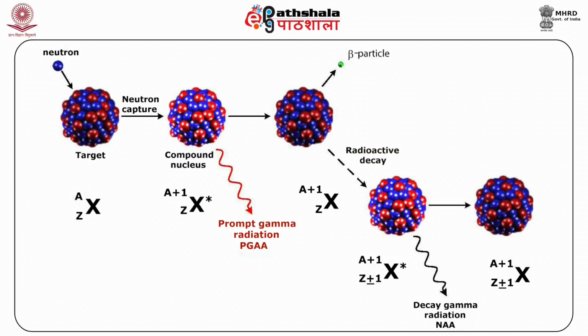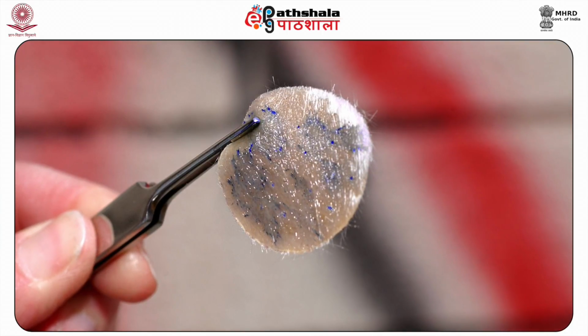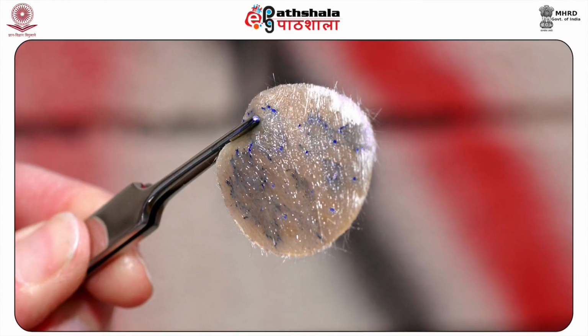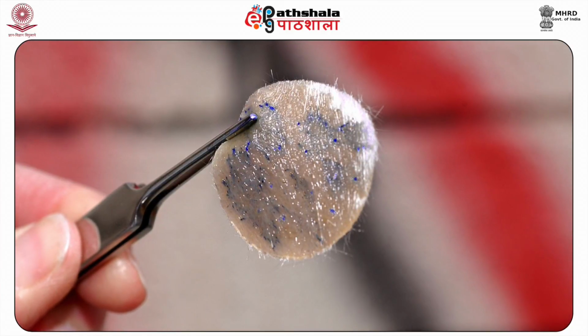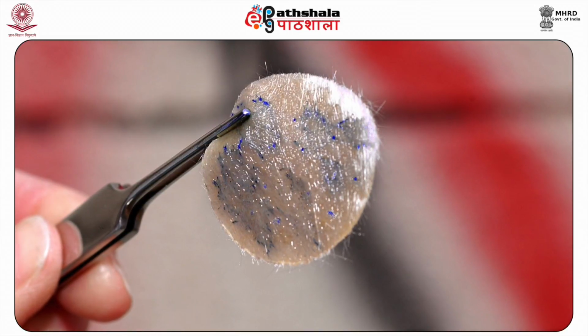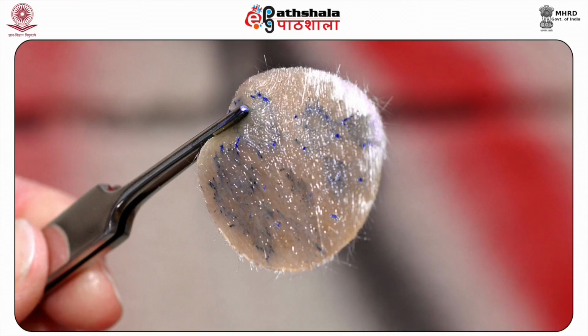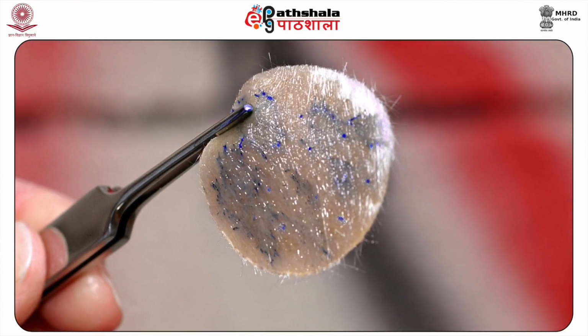For many elements and applications, NAA offers sensitivities that are superior to those attainable by other methods and are of the order of parts per billion (ppb) or better. NAA is generally recognized as a referee method of choice when new procedures are being developed or when other methods yield results that do not agree. Worldwide, its application is so widespread that approximately 1 lakh samples undergo analysis each year by NAA.